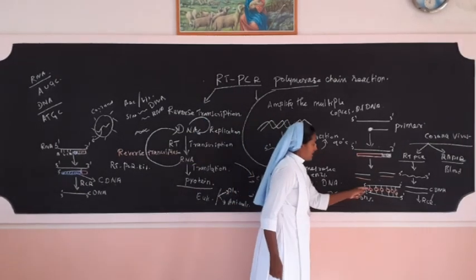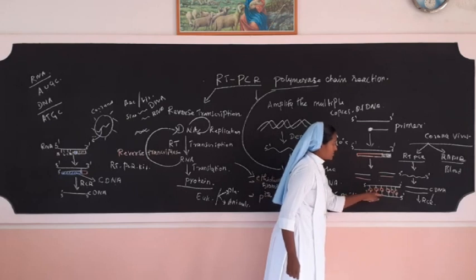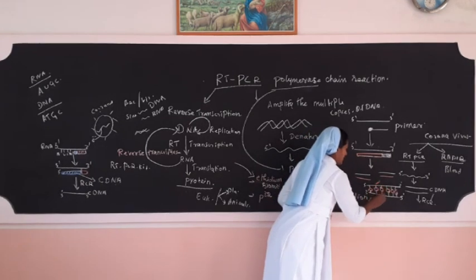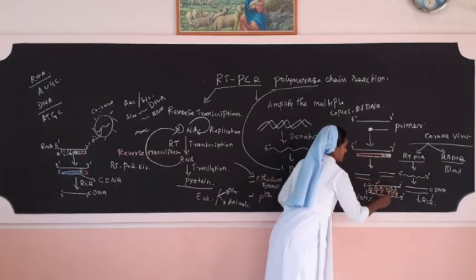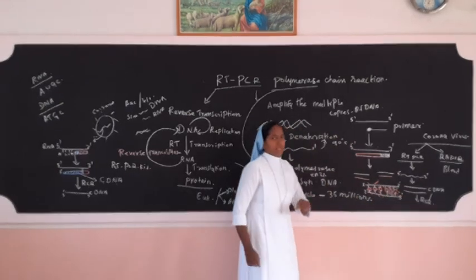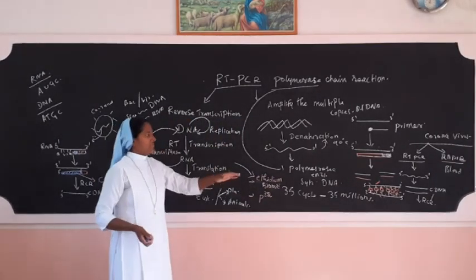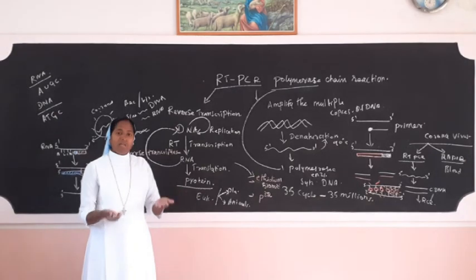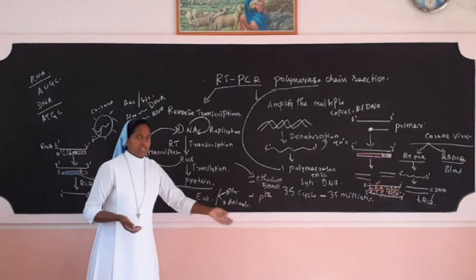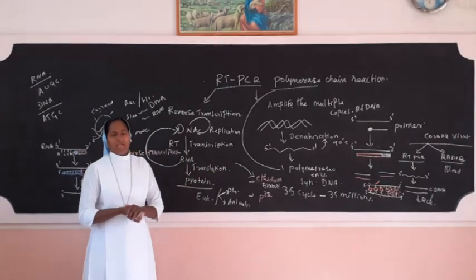Why? Because the dye, the fluorescence, when we apply, it binds in those complementary sequences between those two strands, and they emit that color. Each fluorescence binding place, there will be color produced. So with that, we are able to quantify how many viruses have been present, or how much of the DNA genetic material of the viruses has been produced and amplified.